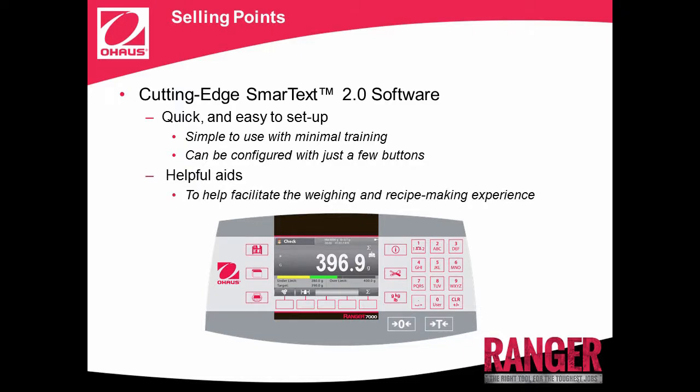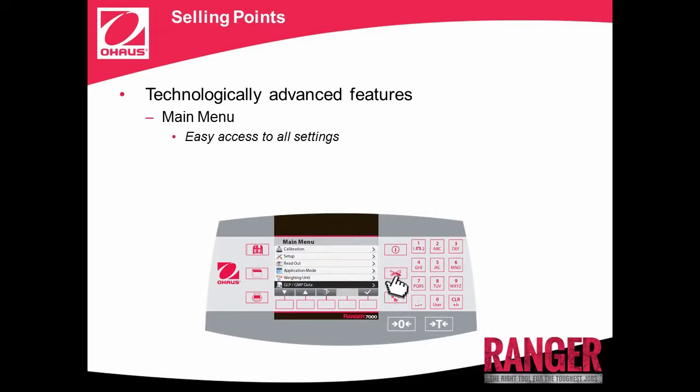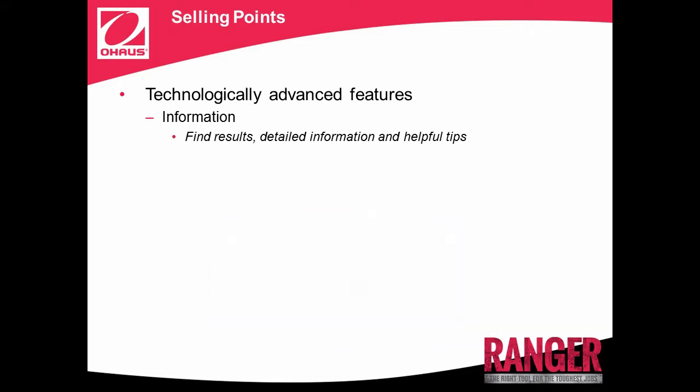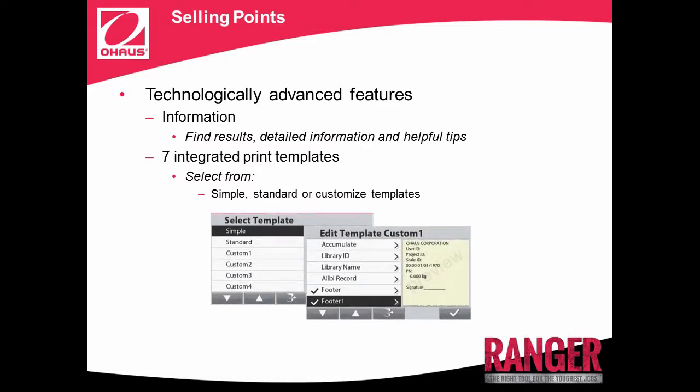Ranger 7000's bright, backlit display not only shows weighing results, but also additional useful information like tare weight, date, time, and application-specific aids to help you with your weighing needs. Some of the technologically advanced features of Ranger 7000's software are the Main Menu tab that brings all settings to the screen for easy access, the Library menu that stores and recalls weighing data, and the Information menu that helps users find Result Summary, Detailed Information, Instructions, and Helpful Tips. Ranger 7000 also features 7 integrated print templates that users can select from: Simple, Standard, or 5 customizable templates.